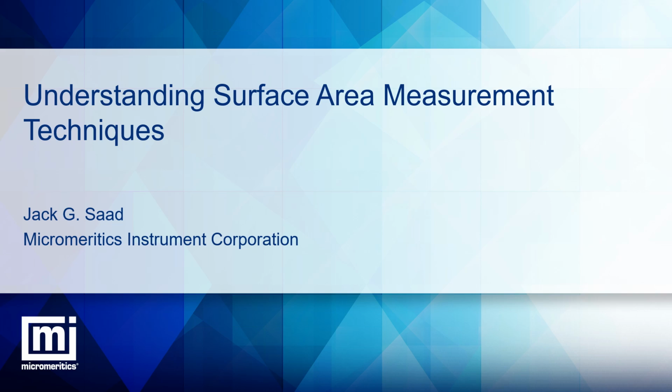Thank you for the introduction, and thank you all for attending today's webinar. Again, my name is Jack Saad. I'm part of the scientific staff at Micromeritics Instrument Corporation, and my talk today is about surface area measurement techniques. The idea is understanding how these techniques measure surface area, and how we can use this to better our understanding of the data that we collect and improve our interpretations.